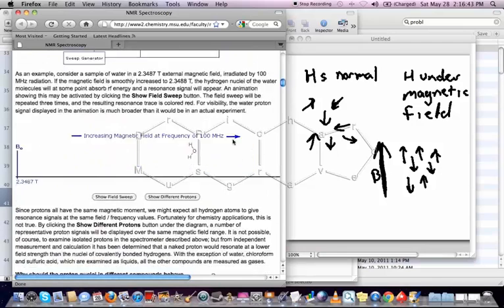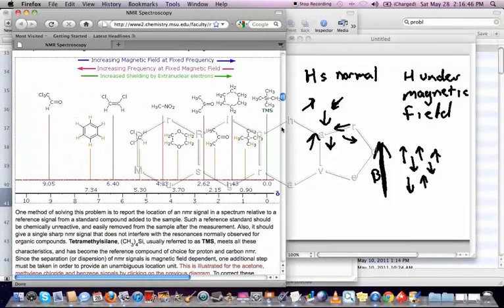So it turns out that the frequency at which hydrogens flip depends upon their environment. It depends on the different things that they happen to be attached to. And you can see various different kinds of hydrogens here in this spectrum. And we've got the ppm scale on the bottom, which is what we typically use to measure frequency in proton NMR spectroscopy. It goes from 0 to 10. And we have two directions that we talk about. This is upfield towards the right and downfield towards the left.